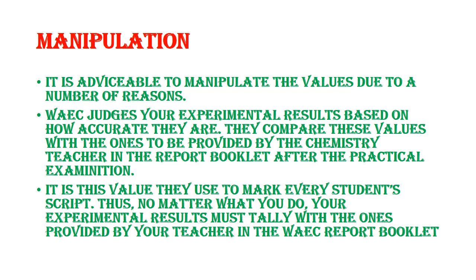Do you understand? And there are side reactions in every chemical process, so this can affect the readings. So that is why WAEC places that rule that the chemistry teacher, using the acid and base used in that center, is to provide a report of the end point. Since you use the same acid as the teacher, you are supposed to have the same end point. So that's why they will use that teacher's value to mark everybody's own.